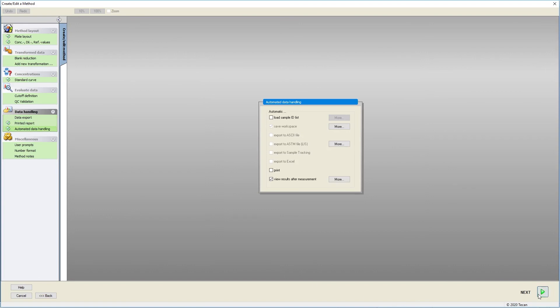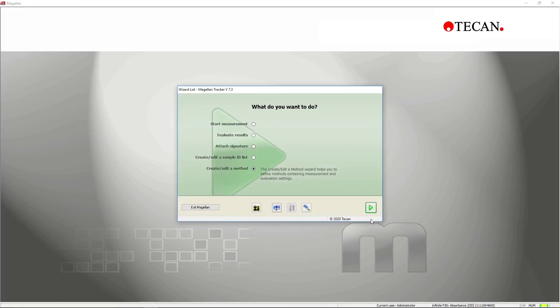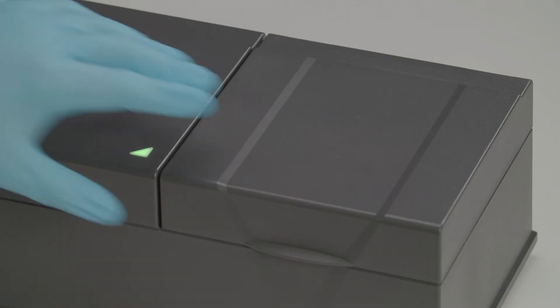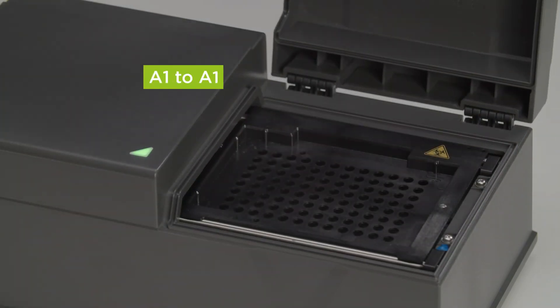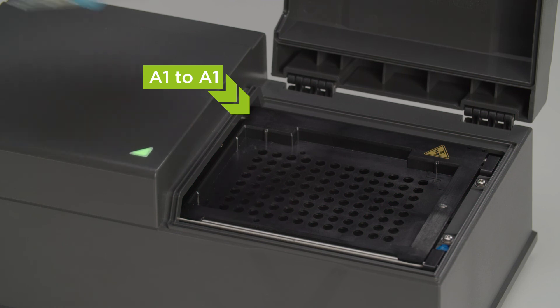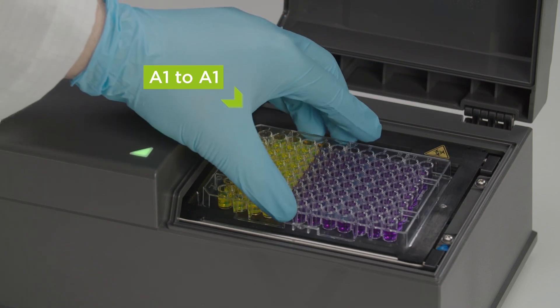When each step is finished, you can save your method. Measurements are very straightforward with Magellan software. Firstly, put the plate on the carrier in the correct orientation.